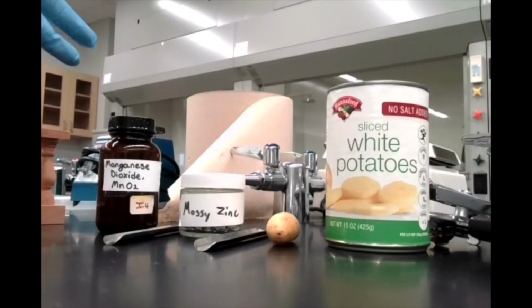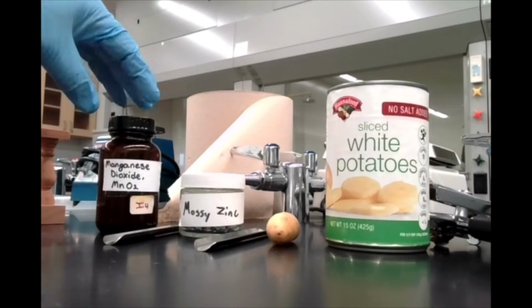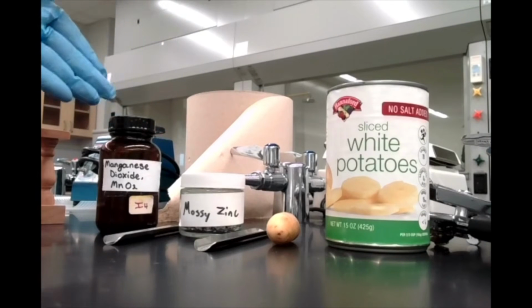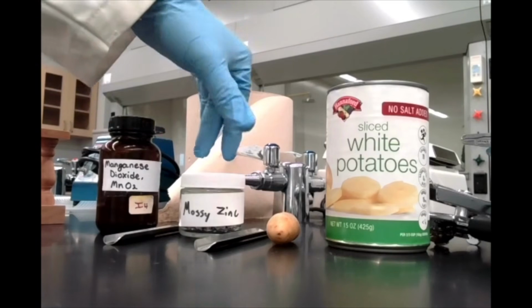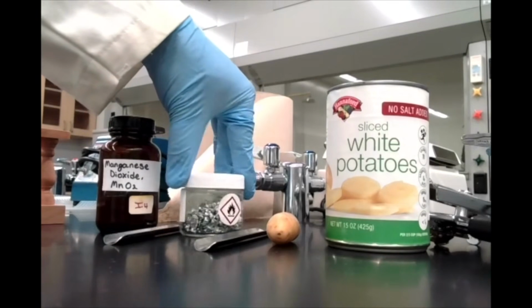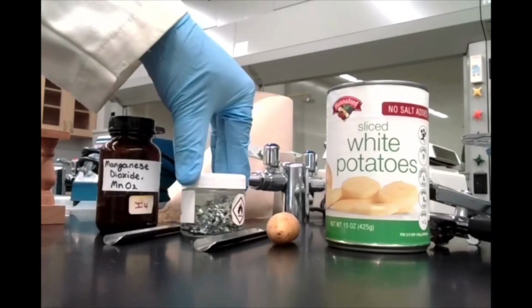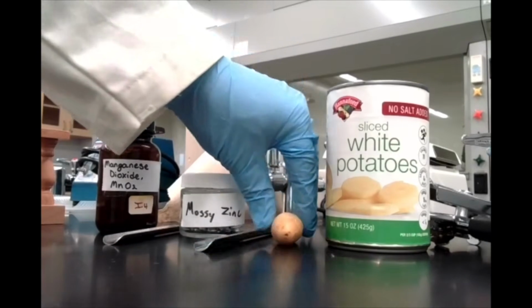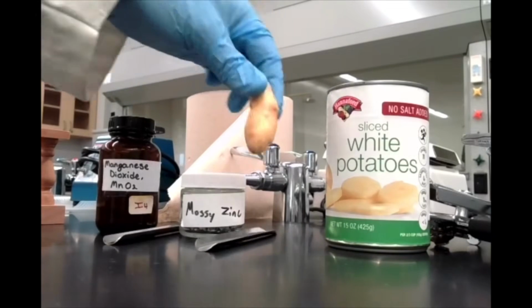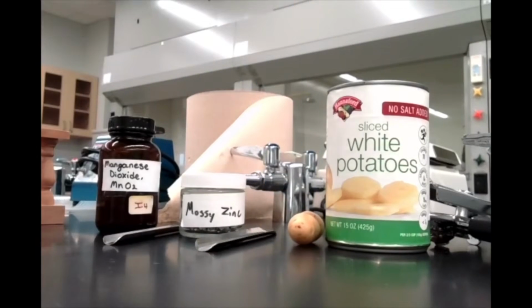The various catalysts or potential catalysts we're going to use today include manganese(IV) oxide, commonly known as manganese dioxide. We have mossy zinc, which is basically just little chunks or granules of zinc. Over here we have the world's cutest potato. Potatoes are very versatile. You can boil them, mash them, stick them in a stew. But they also contain catalase.